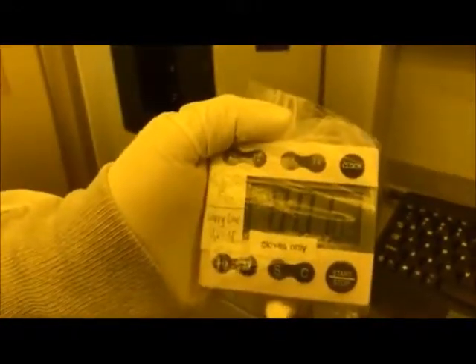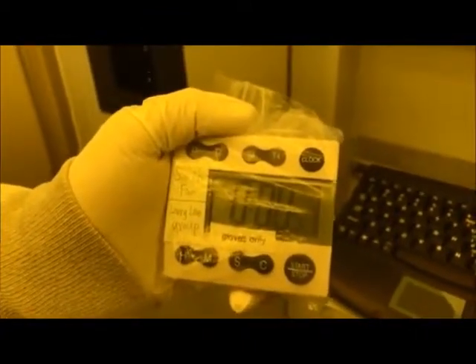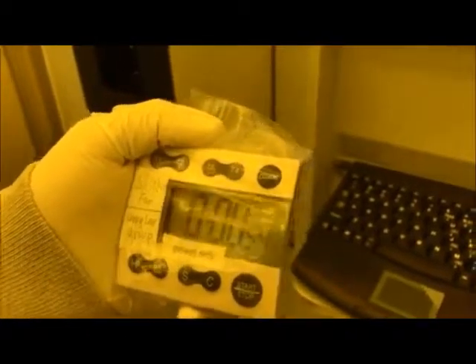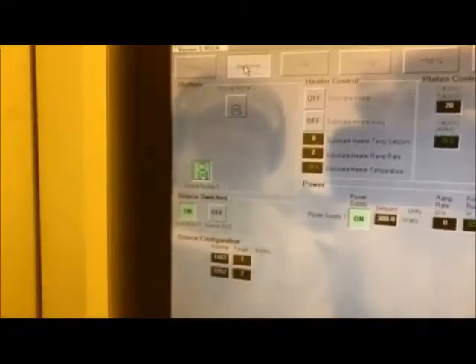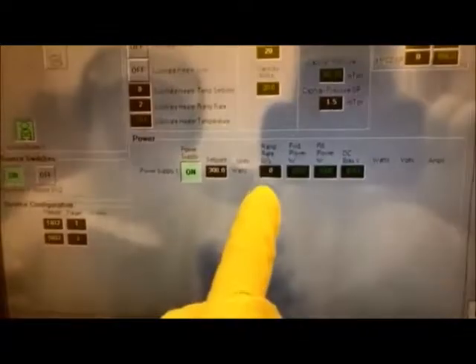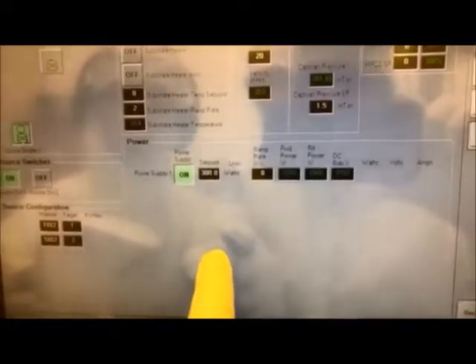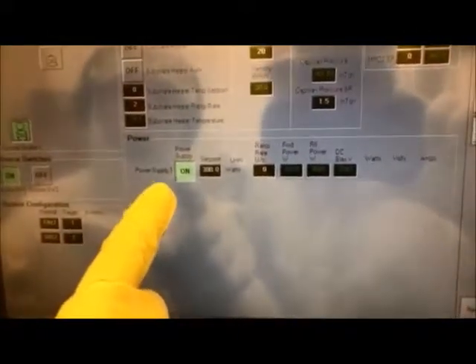We have about 1 minute before we want to close the shutter, based on the deposition rate we have for the target thickness. So when the timer goes off, my first step will be to close the shutter, and then I will select the ramp to 10. So we ramp down the power, we're going to ramp down 10 watt per second. Once we set to 10, I'm going to set this to 50. And then once it goes to 50, I can turn off the RF power supply. So we have 25 seconds.